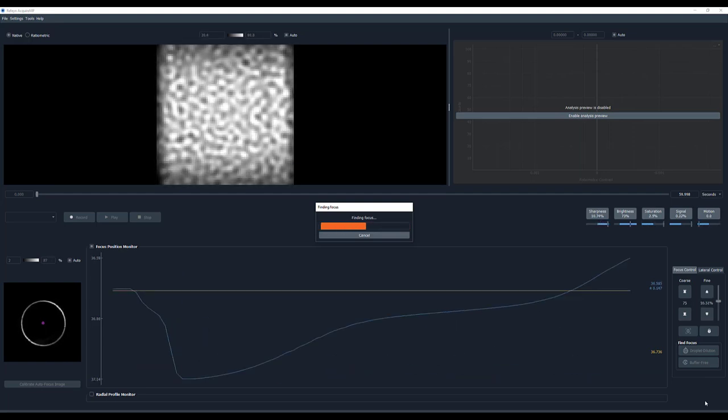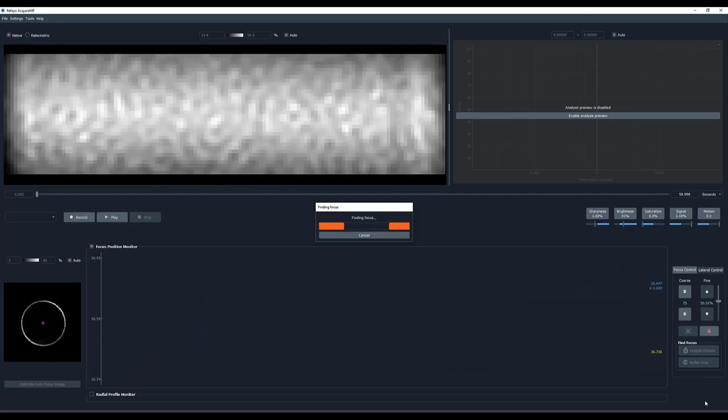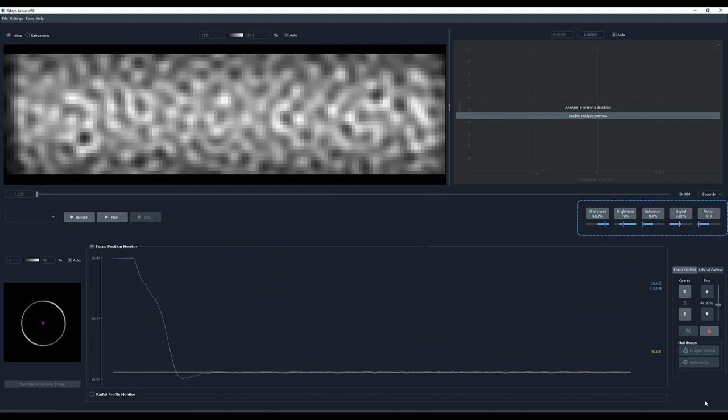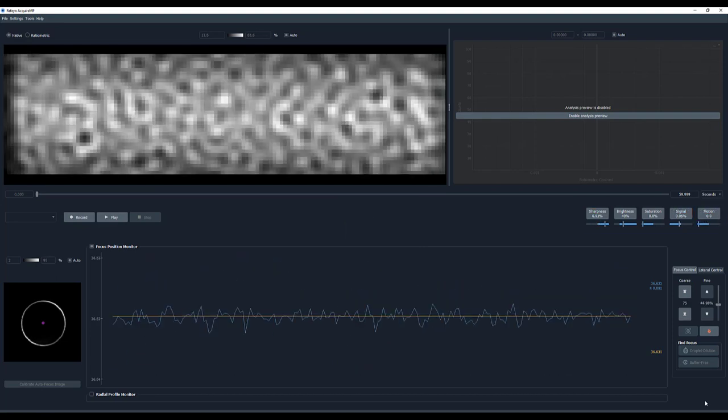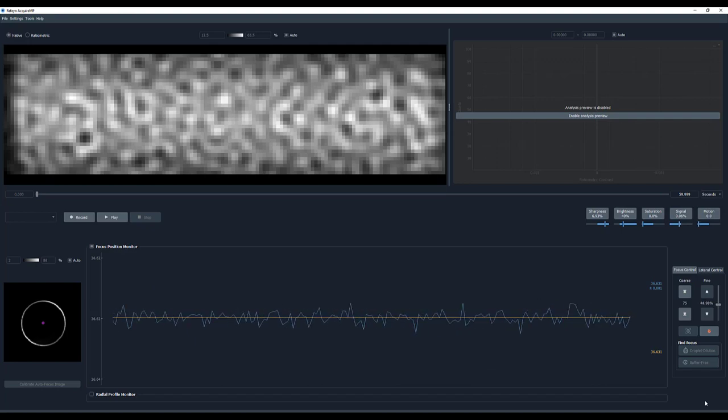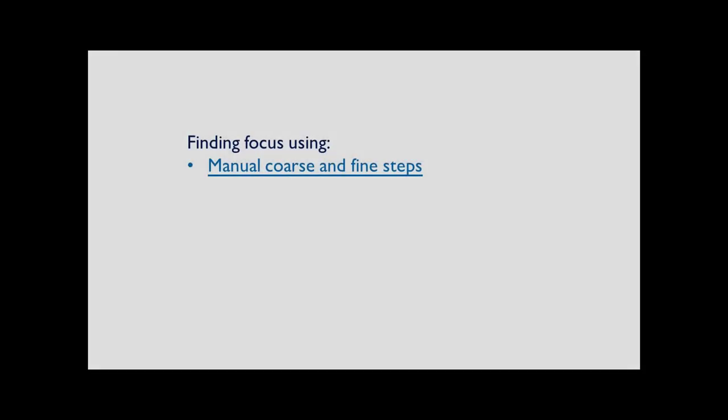Once done, the focus will be set and locked. After focus has been found, check that the quality metrics are in the correct range and that you are ready to add the sample to the buffer and make the measurement.